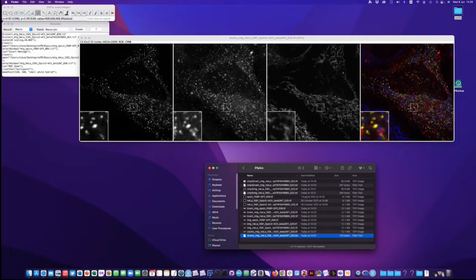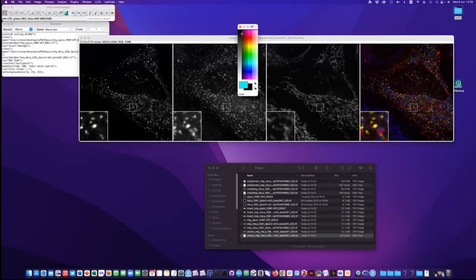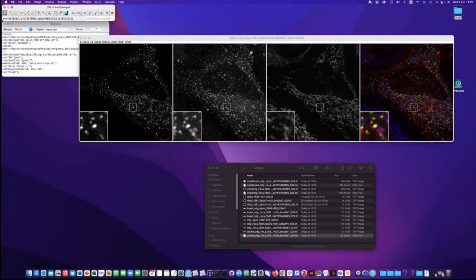Just want to show you one other trick with this ROI Zoom business. So maybe this spot was interesting to us, but perhaps we want to also focus on this spot here. So what we can do is add another zoom on top, and we can do this up to 4 times because we've got 4 corners of the panel to play with. Let's just do that, but we don't want to add another white box because that would be a bit confusing. So what we can do is pick a different foreground color up here. Let's just pick blue for the sake of this demonstration.